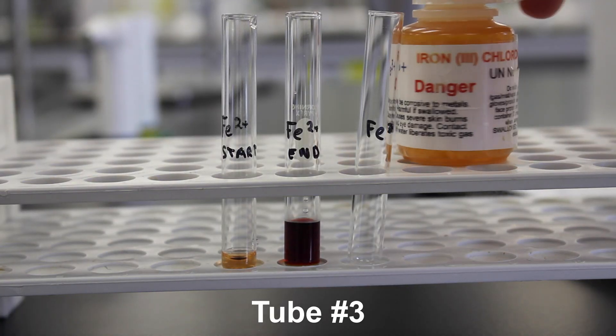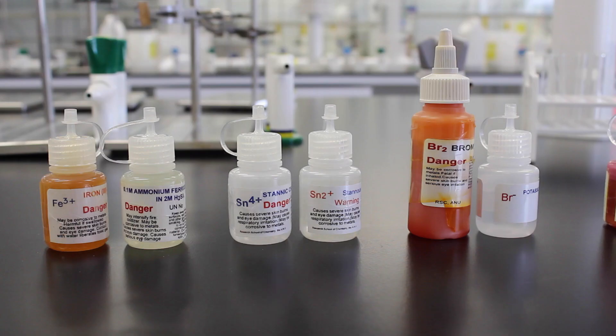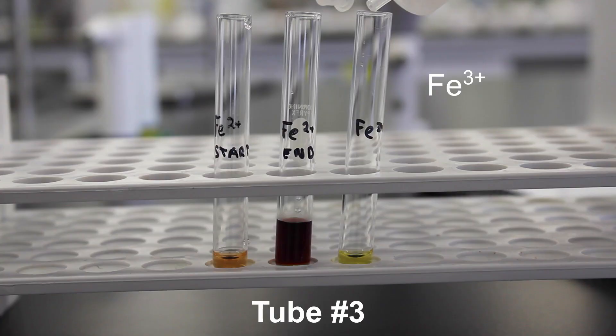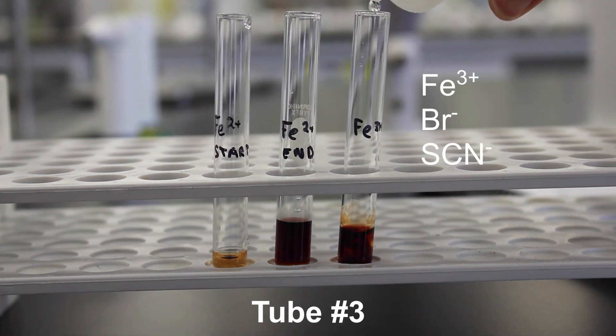Now let's put a solution of iron 3+ into a third test tube and then add some drops of bromide ions. In this instance we'll test with thiocyanate ions again, but because we started with iron 3+, a dark red solution indicates no reaction has taken place because no change has occurred.